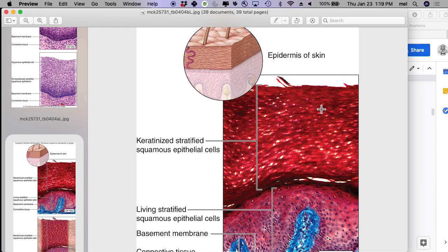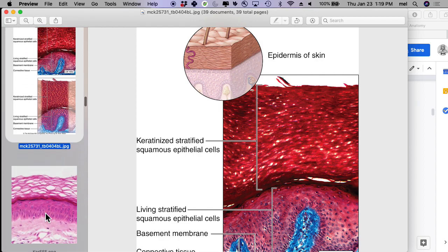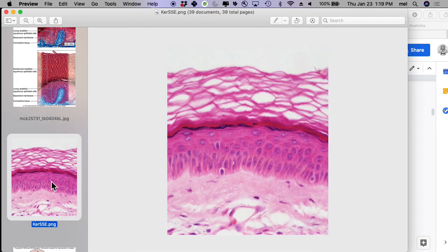Does that make sense? Okay, and the amount of keratin differs wherever you're looking at on your body. Lots and lots of abrasion, right? And also potential for needing grip, like on your hands and the soles of your feet, you're going to find a really thick layer of keratin. But in some areas where you have really, really thin skin and it dries out more readily, then it's going to look less like that and more like this, right? A kind of thinner layer.